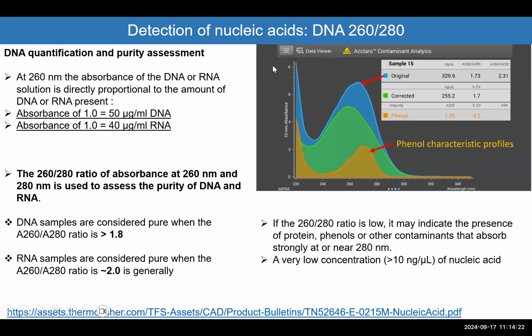Question. Can you please repeat what it means when it starts high? Yes. So I'm saying every time you have a nanodrop graph or spectrophotometer reading that you obtain, directly look at where the start of that peak is compared to the top of the peak.